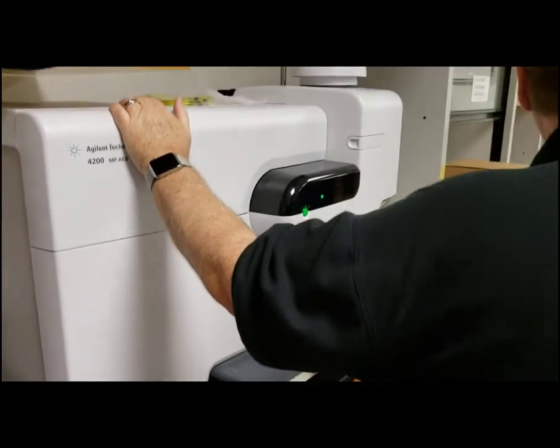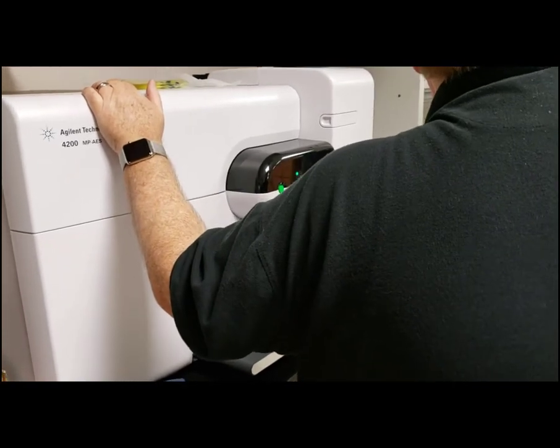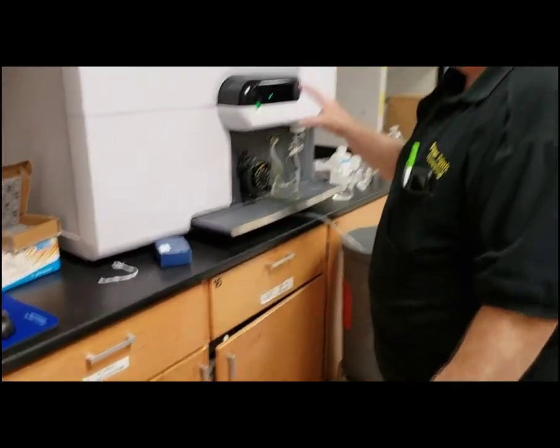All right. So if it's ever clogged, is there any error that you see on the computer? Yeah, it will give you a diagnostic that it's not able to cool down, because it takes that air to cool down everything inside. Okay, so it would be restrictive.